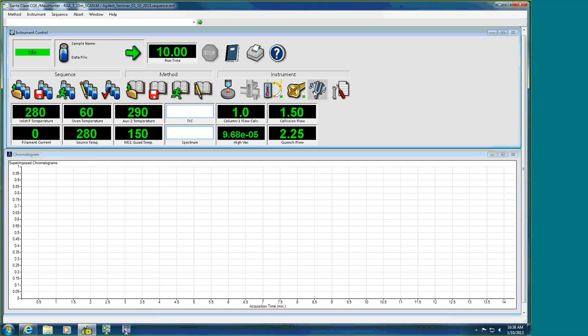And currently, you can take advantage of MassHunter Qual and Quant for your 5975 and 73 after converting data files, and you'll soon be able to take over MassHunter acquisition for your 5975 as well.